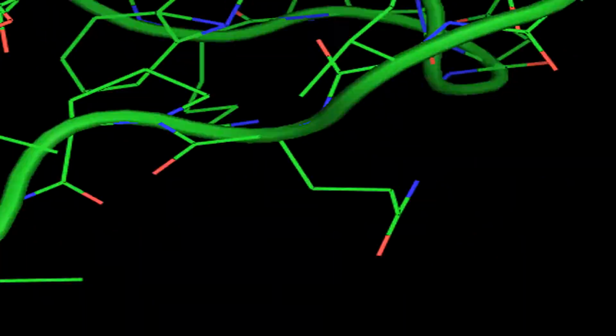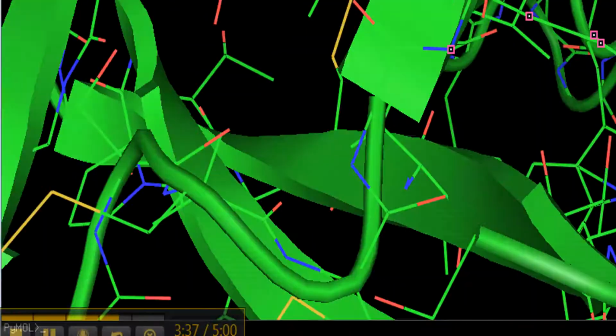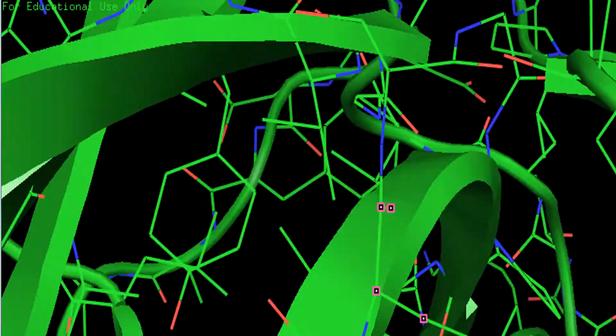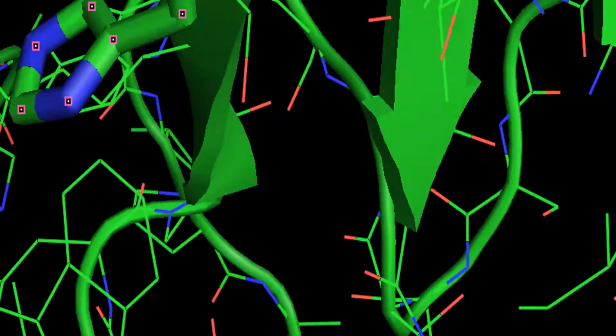I can also use a similar command, SELE res i 57, to select that residue itself, or I could pick it out from the sequence viewer. And as always, middle clicking on that residue in the sequence viewer or within the graphics display will center on it.